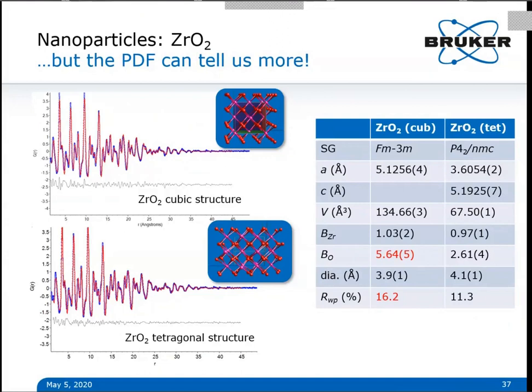Okay, great. So I think we have a couple of you asking if it's possible to upgrade your instrument. And yes, it's absolutely possible to upgrade your instrument. The exact opportunities will depend on your existing configuration.